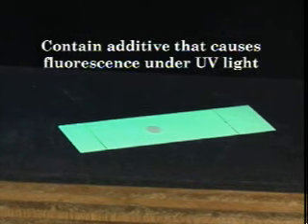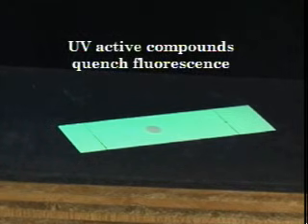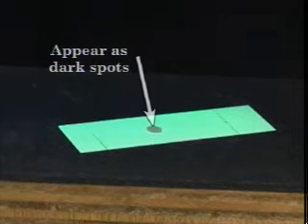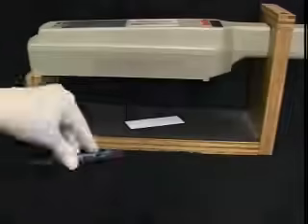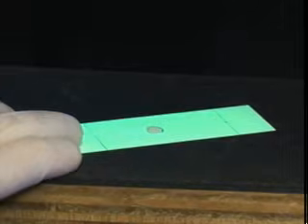When the compound of interest is brightly colored, no extra steps need to be taken to visualize the spots. However, most organic compounds are colorless and cannot be seen on a TLC plate with the naked eye. Fortunately, most TLC plates contain an additive that causes the plates to fluoresce under ultraviolet light. Certain UV active compounds are capable of quenching this fluorescence, and as a result, they appear as dark spots on the glowing TLC plate. UV lamps are commonly found in laboratories for just this purpose — simply place your plate under the lamp, turn it on, and mark the spot with a pencil. A number of TLC stains have also been developed to aid in the visualization of spots that cannot be seen under UV light. You can watch the advanced thin layer chromatography video for a demonstration of a few of these staining procedures.